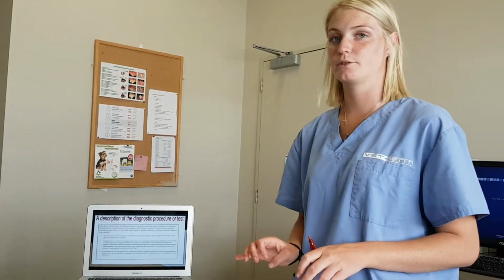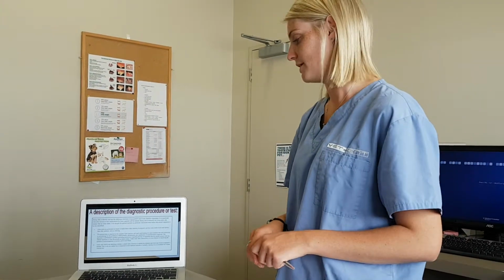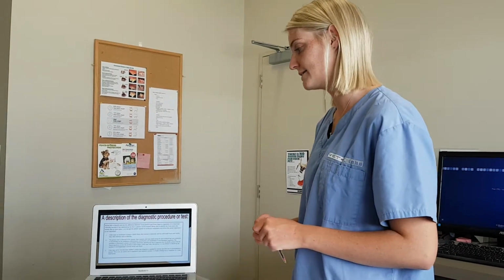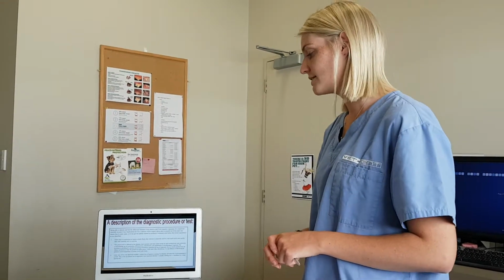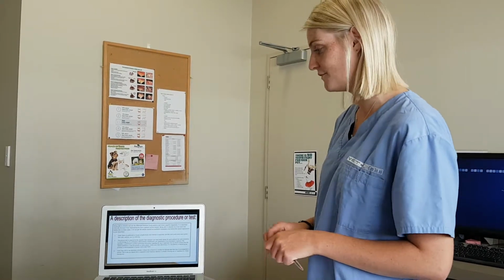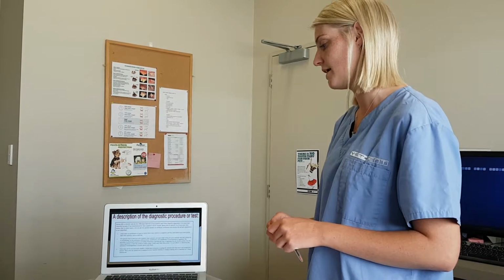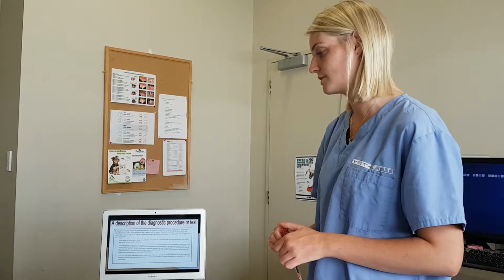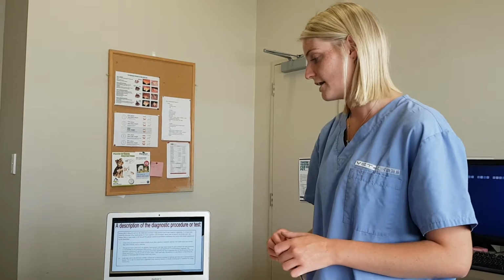Being able to identify and see the difference between both gram-positive and gram-negative organisms is very important clinically because it has implications for how long a patient will be treated. Being able to identify gram-positive and gram-negative organisms means that in some cases a vet can get patients on antibiotics as soon as possible, treating even before the actual organism is identified.